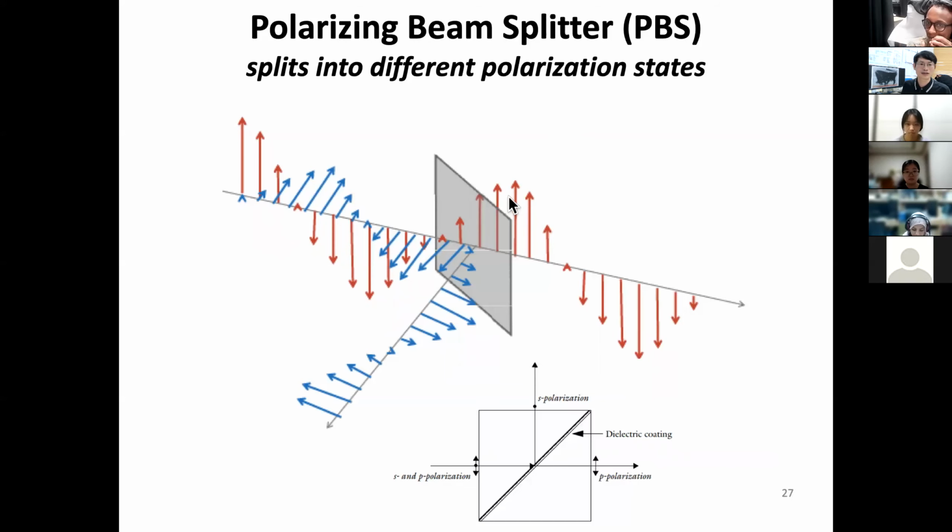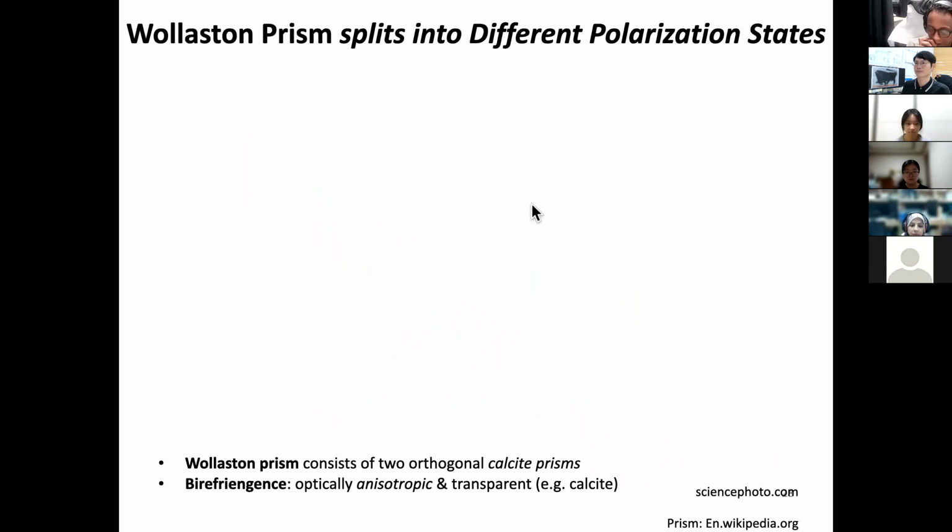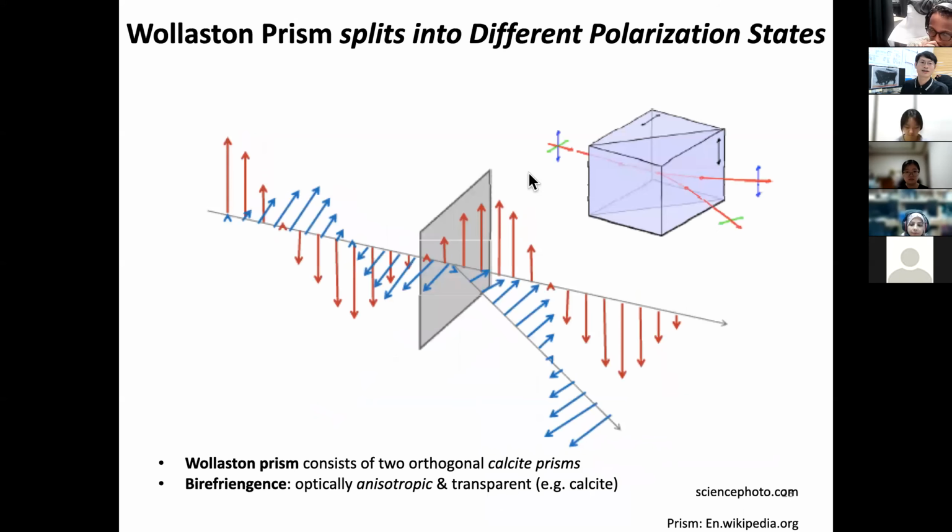This is a good way of controlling light power, because with the input and the output, you can take off the other polarization. So if you have a polarization angle changer here, such as a half-wave plate, you will be able to control the amount of light. Okay, and there comes a very interesting one, calcite.